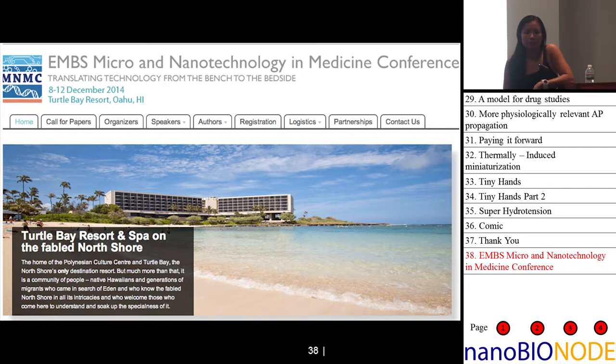So it's based on the experimental result and extracting the features from the image and then recognizing the pattern you are targeting. Yeah, exactly. And it seems relatively good in being able to predict. And we give it an unknown response, but we know the answer, to test it. And it seems like it's pretty good in terms of its prediction capability so far.